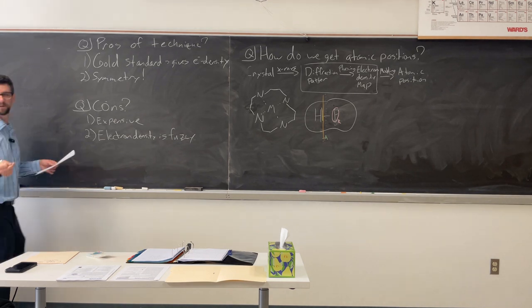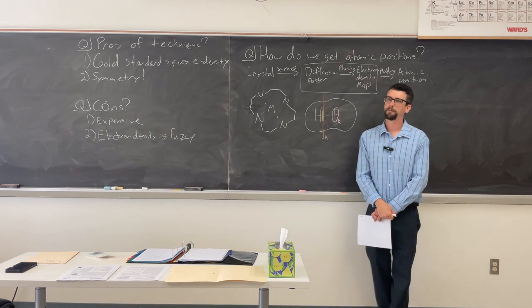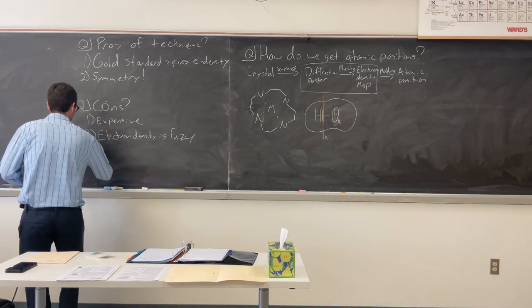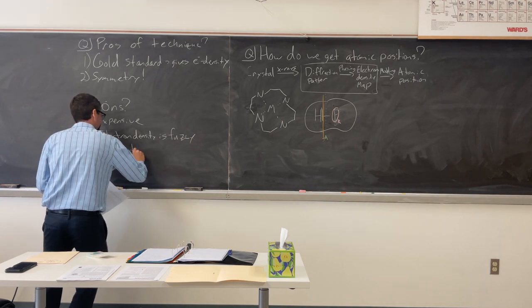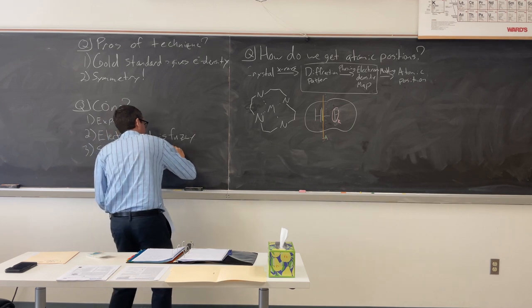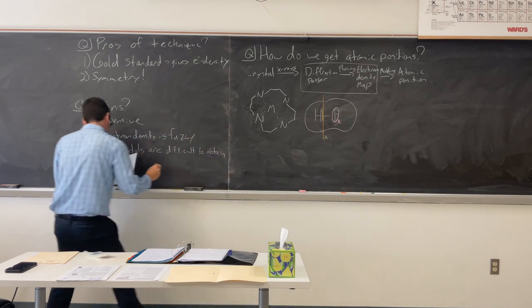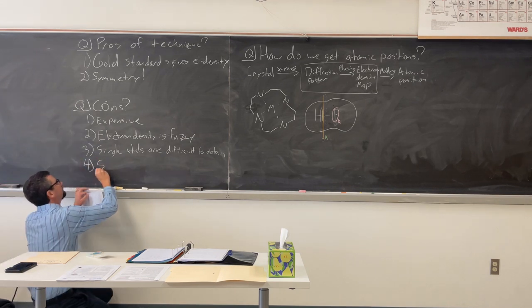Think of your experimental setup now. You have to have a single crystal. It's sensitive to temperature.